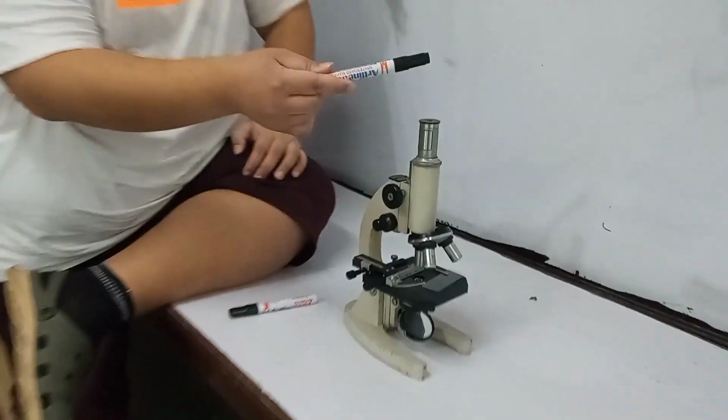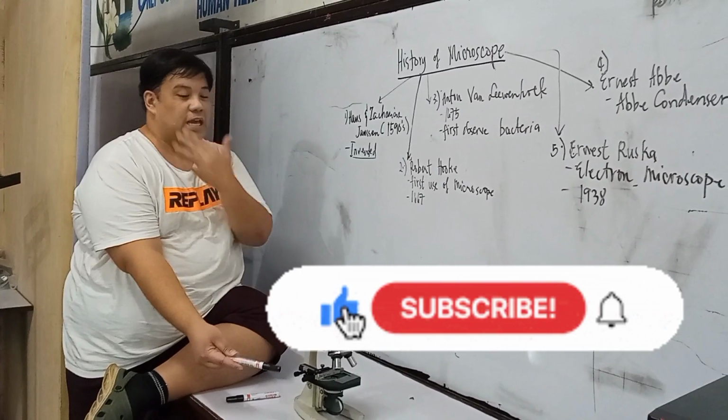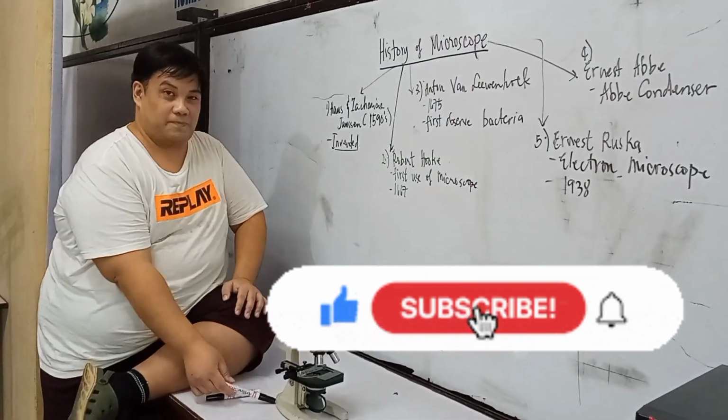I hope you understand all of the parts and functions of the microscope.